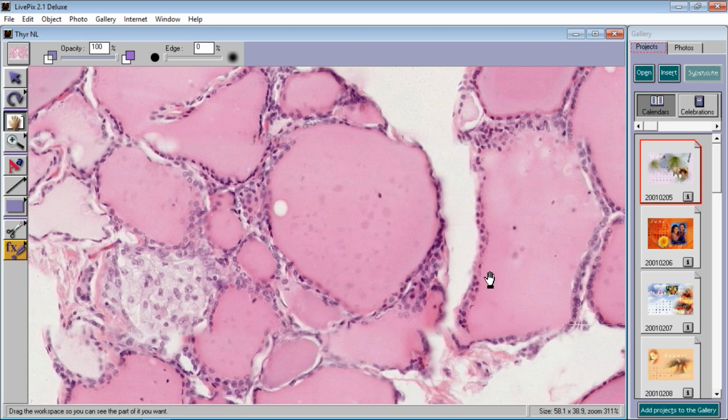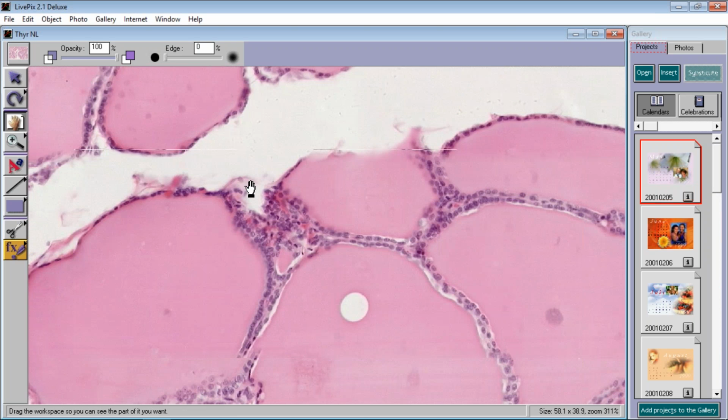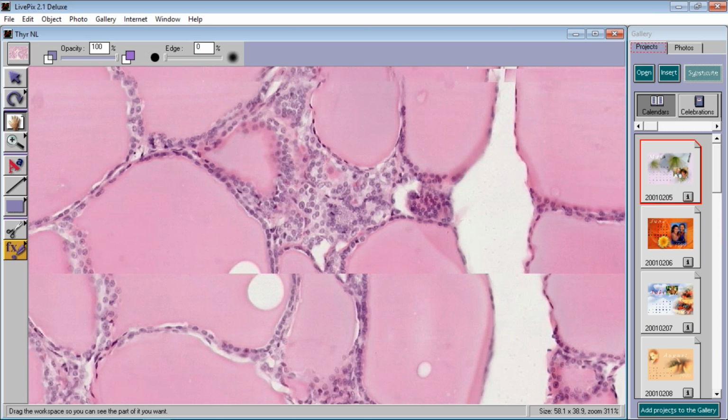They go by various names. We'll call it an interfollicular cell. And look, there's probably another interfollicular cell. And there's definitely an interfollicular cell. So whereas these cells are storing or making the thyroid hormone, these cells are making the calcitonin, okay, which counterbalances parathyroid hormone.